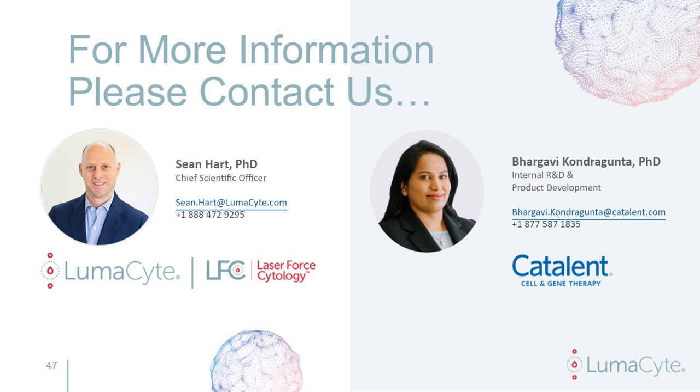And Bhargavi, can Radiance be used for cell subcloning or cell line development? Yes, that's a great question. Although we haven't used it for that application, I believe so, that we could use Radiance for identifying the differences, especially the phenotypic differences between different cell types and cell clones, and then correlate that to the yield from those subclones. And Sean, do you want to add to this?